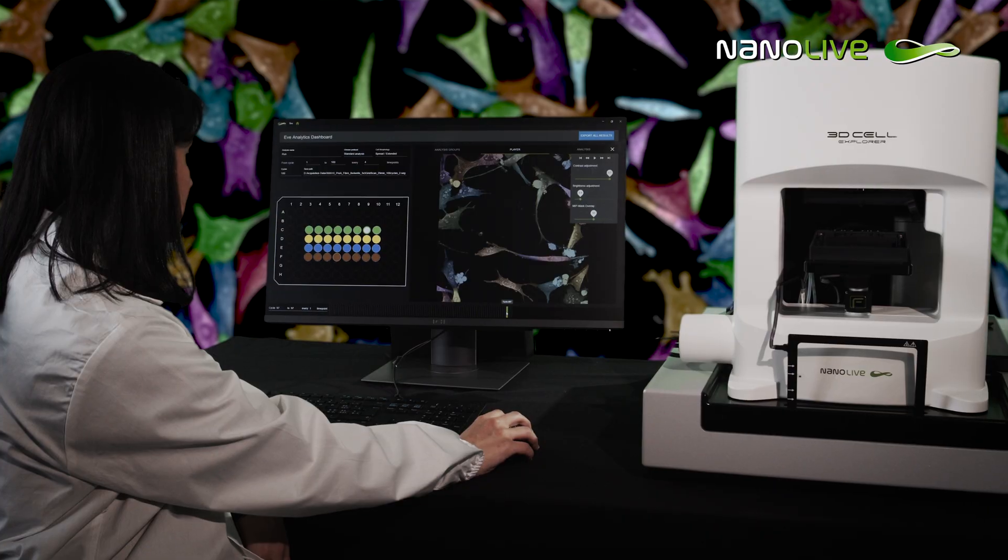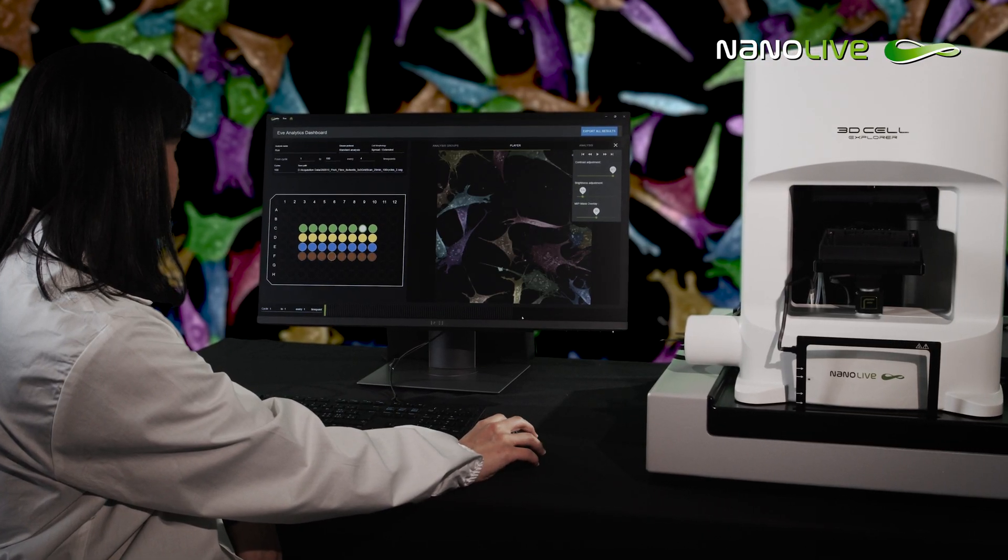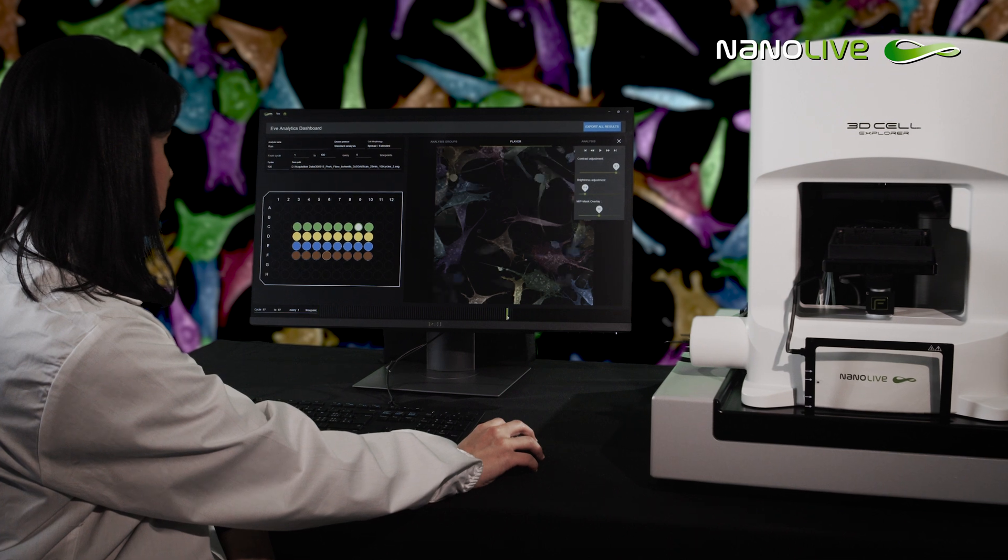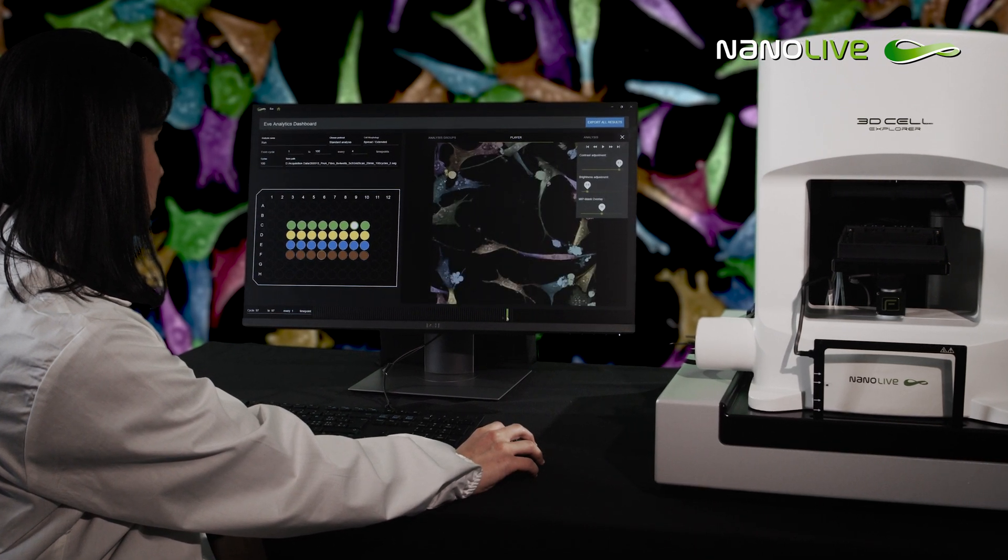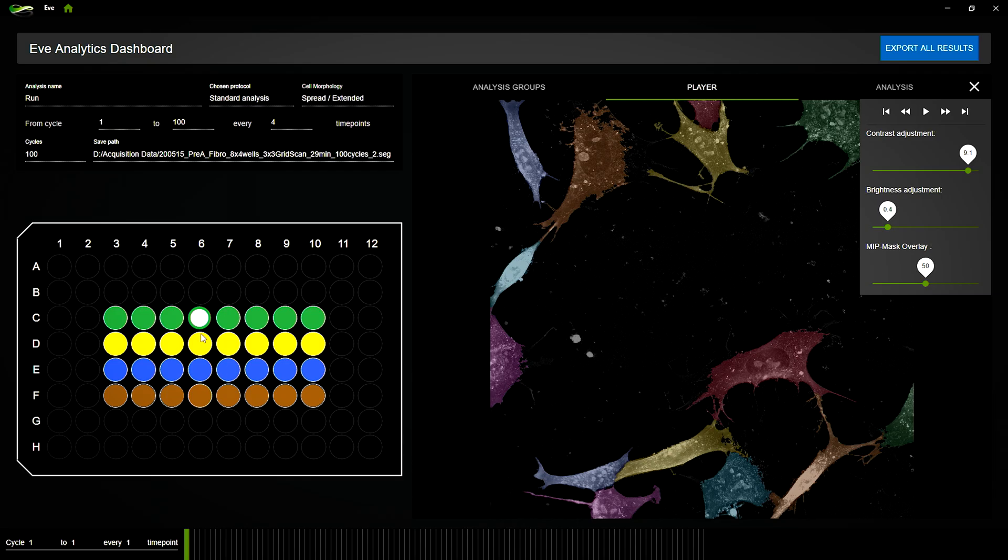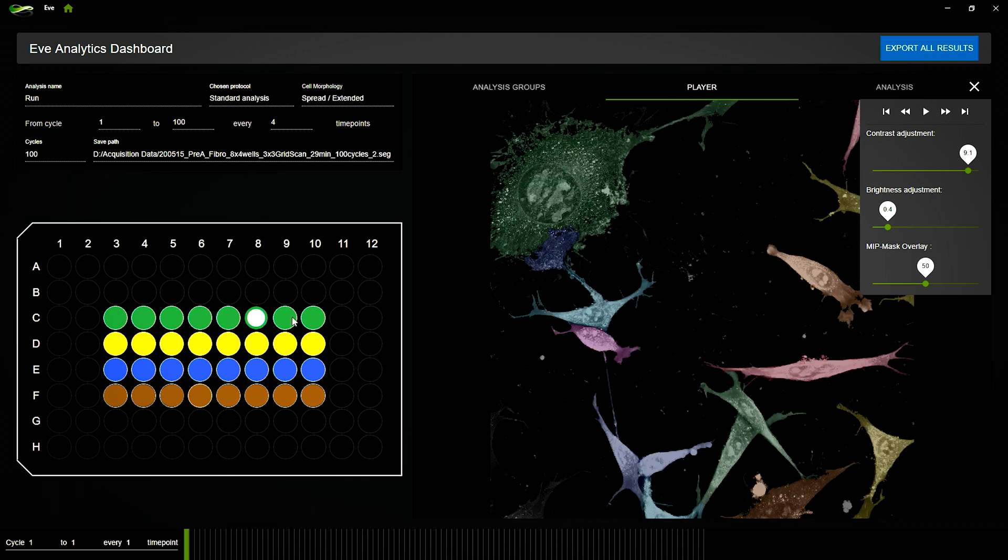Once you've found what you're looking for, you can proceed to analyze it. NanoLife's analysis software, EVE Analytics, delivers robust and high-precision segmentation masks of your cells, whether they are sparsely or densely populated, over long periods of time.